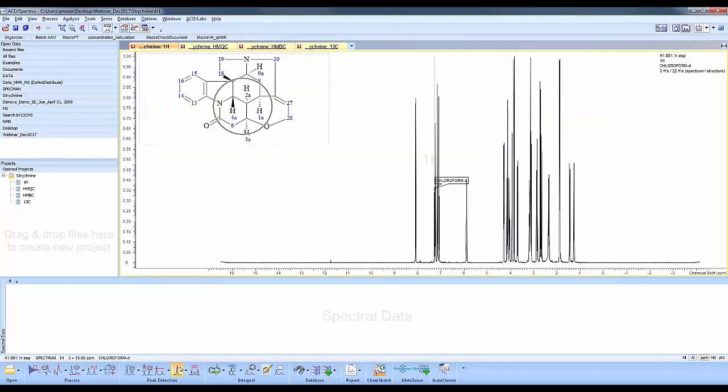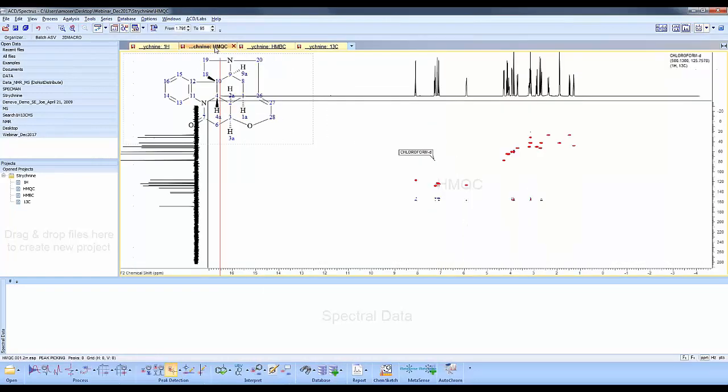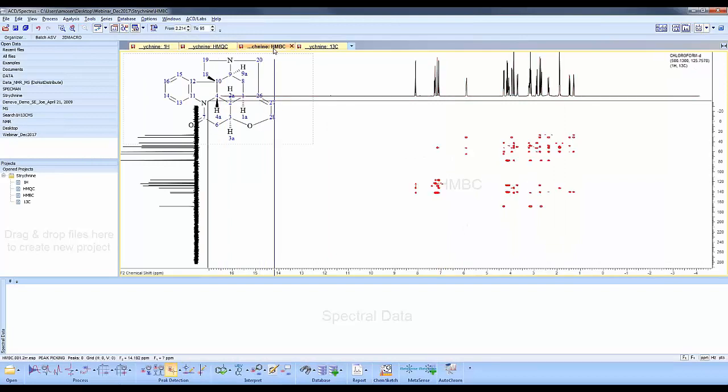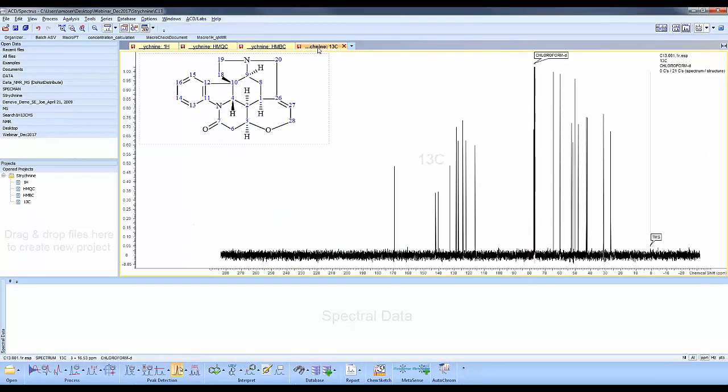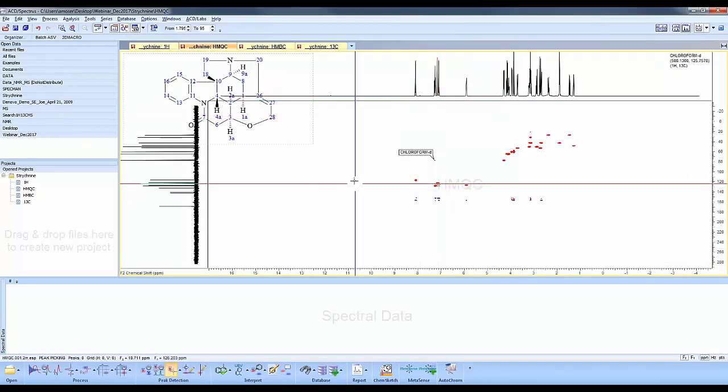We have our proton NMR, structure attached, and solvent identified. We have an HMBC and a carbon NMR. And you can see in the 2D, we have our 1D attached to the 2D axis.